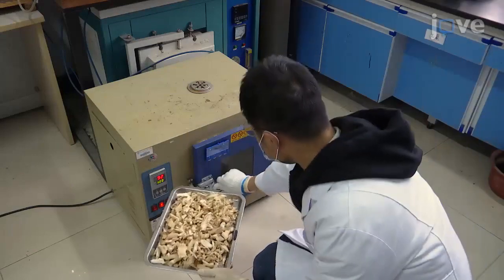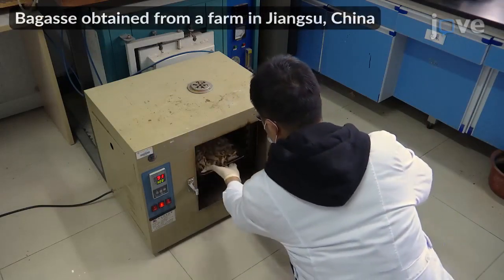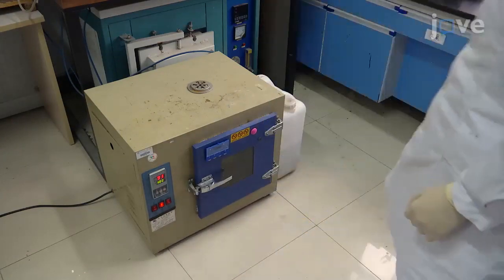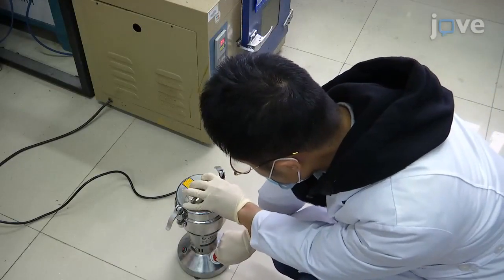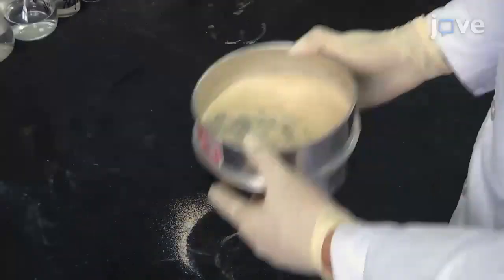To begin, rinse the bagasse with deionized water and put the samples in a drying oven at 100 degrees Celsius for 10 hours. Crush the dried bagasse with a grinder. Then, sieve the powder through a 50-mesh sieve.